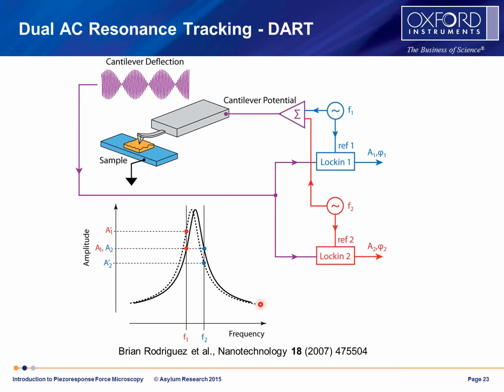Now let's imagine that we go over a sharp feature in the sample such that the resonant frequency goes to a lower value, and so that's this dashed curve here in the amplitude. What you see there is that the amplitude at the lower frequency, F1, actually goes up because that peak shifts to the left. The amplitude here in blue of the higher frequency actually drops.